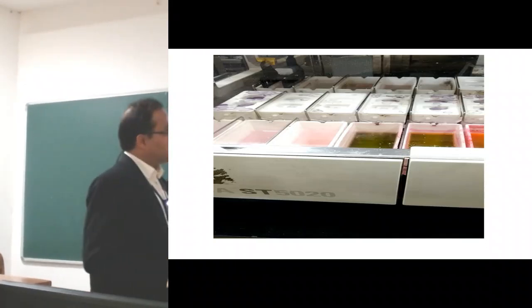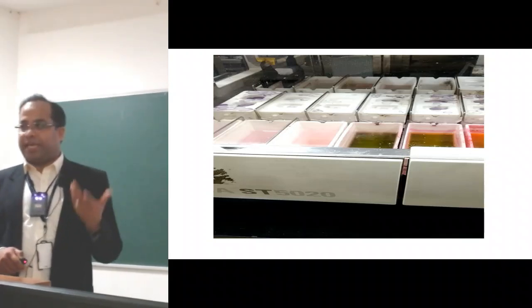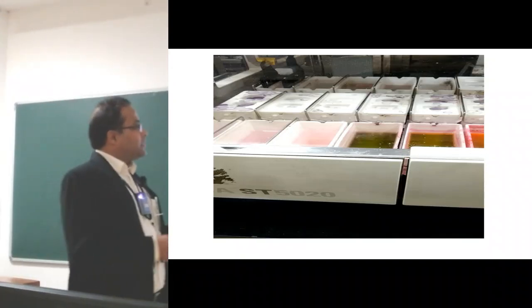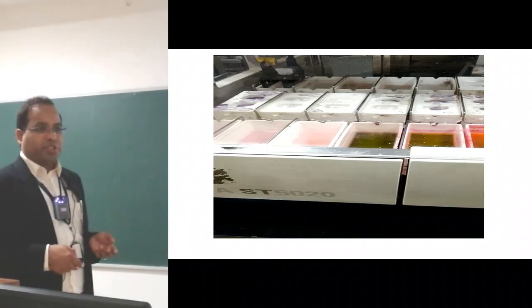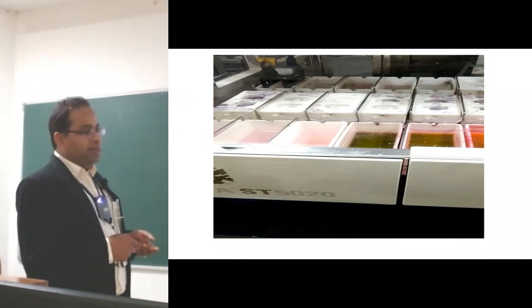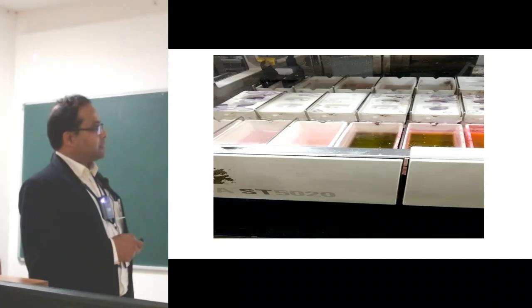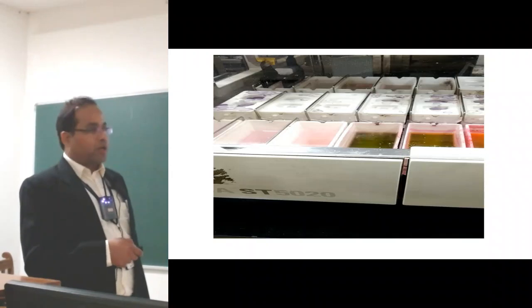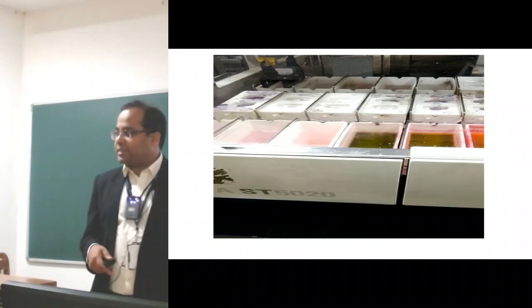So what happens is, this is our automated stainer. For a big lab like ours, it is difficult to stain each slide manually, which is around 400 slides per day. So this is an automated stainer, which contains the different staining reagents, and there is a robotic arm containing the rack here. You can barely see the robotic arm with the rack of slides, and they go from one container with the reagent at a particular concentration to the other end, and that is how it gets stained.